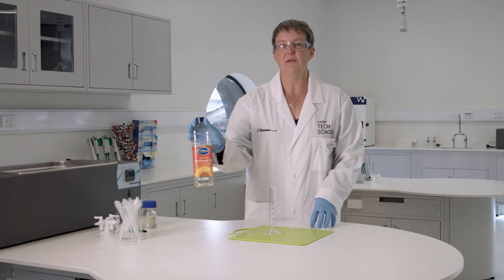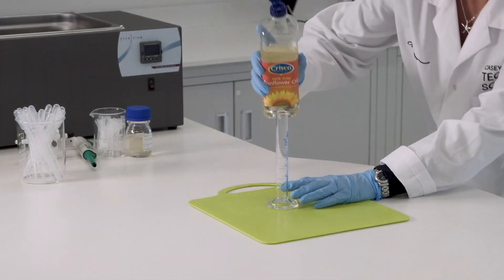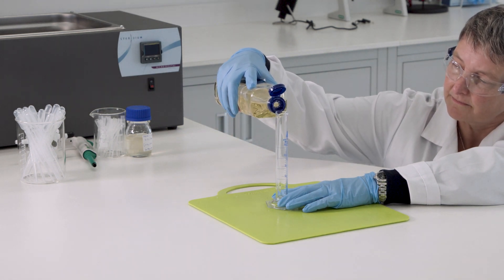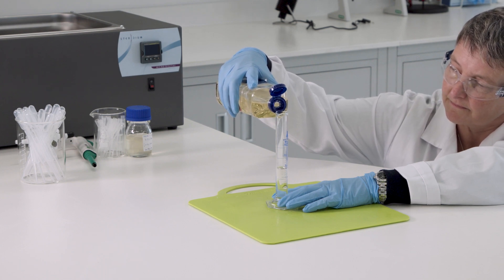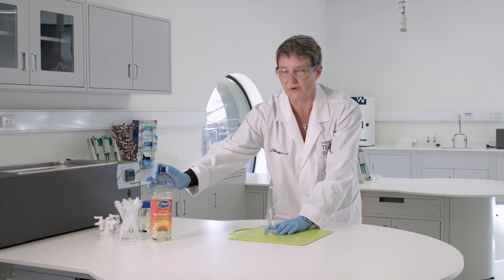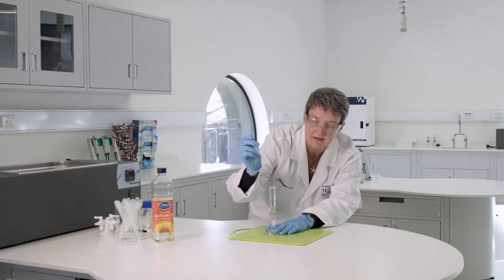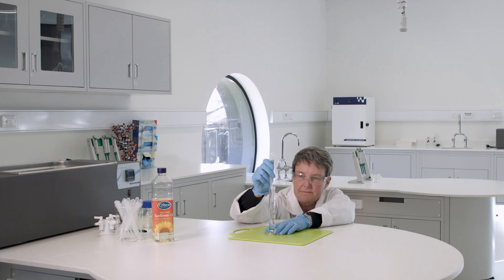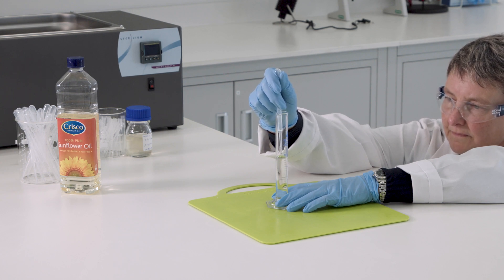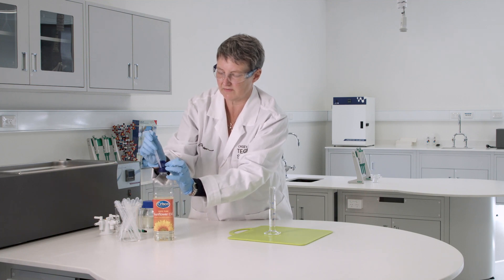We're going to be using sunflower oil today. I'll start with 20 mils of sunflower oil — and as always, bob down to make sure you're seeing things accurately. Because we've got such a viscous liquid, you need to go slightly over and then take out the excess. Okay, so I now have 20 mils of sunflower oil.